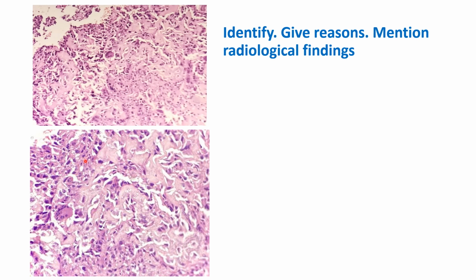So the material which the tumor is producing is osteoid. That means non-mineralized bone material.